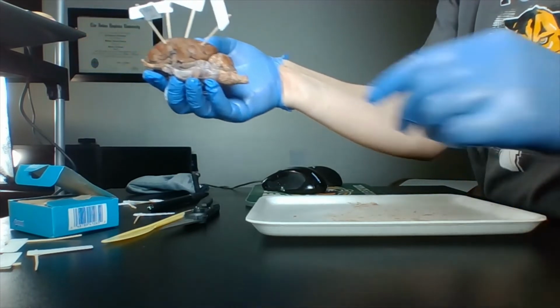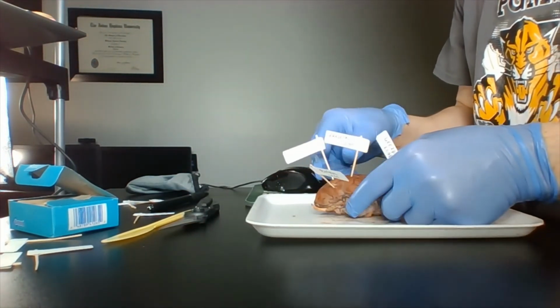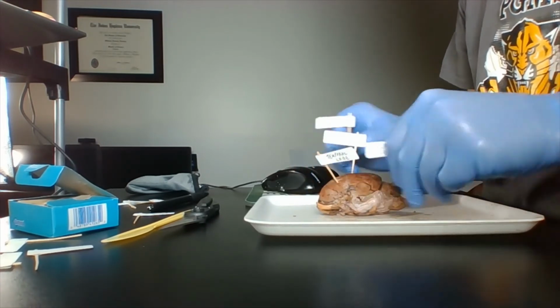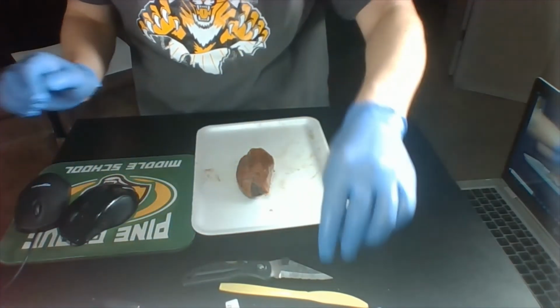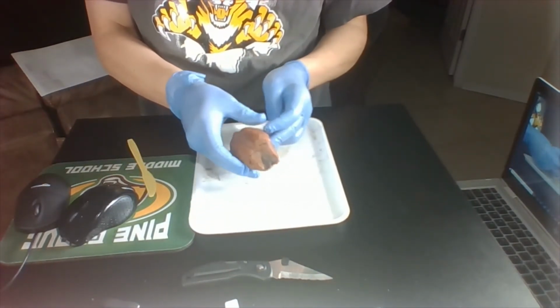Top view, and again, in the PLTW workbook, you'll see that they did both sides. We are only going to have to do one. Okay, so that was the external part, meaning the outside. So we're done with the outside of the brain.